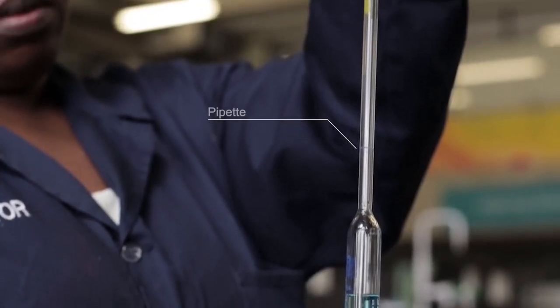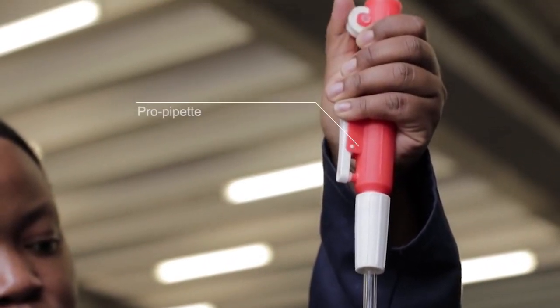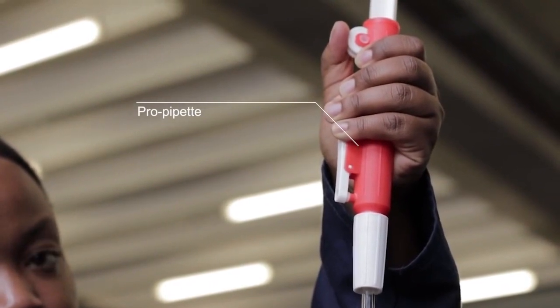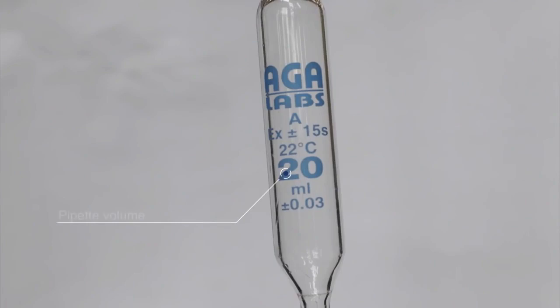A pipette is used to measure a volume of solution with extreme precision. This is done by using a pipette filler to suck up the solution. Pipettes are found in different sizes. This is the volume of the solution to be delivered, which should be recorded as 20.00 milliliters.